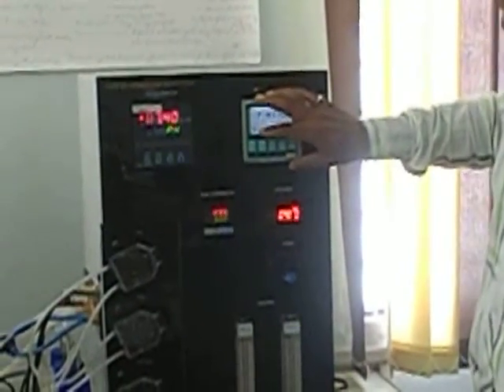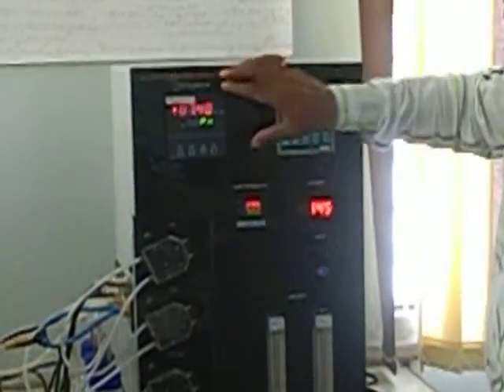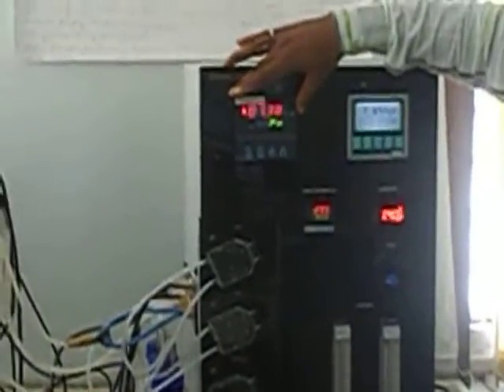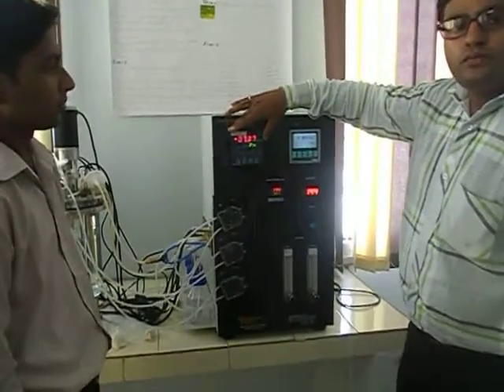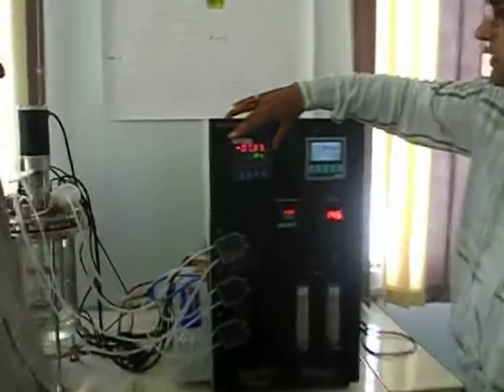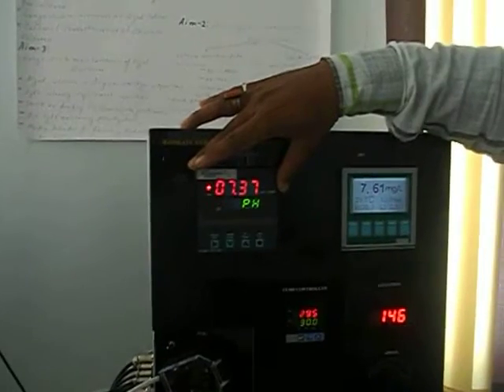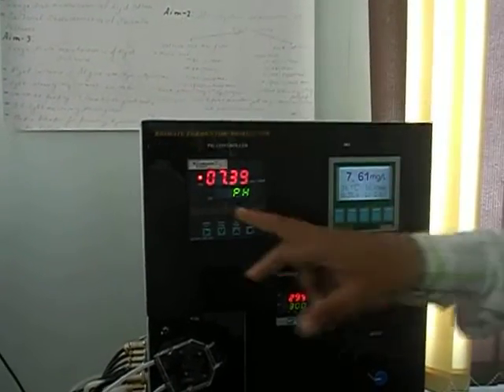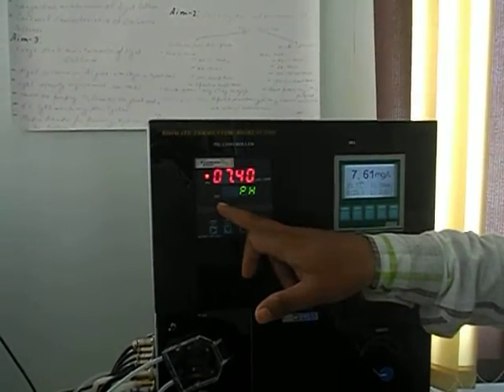Next is the pH controller. We have the 0 to 14 pH range. This is the process value and this is the set value.